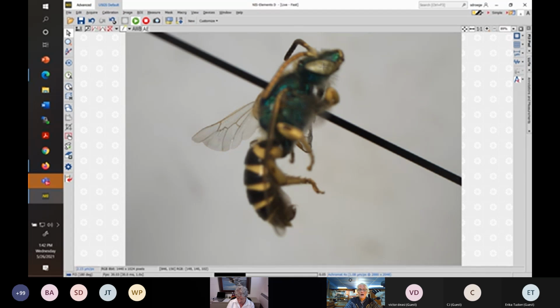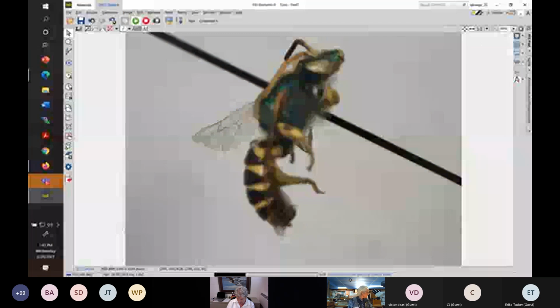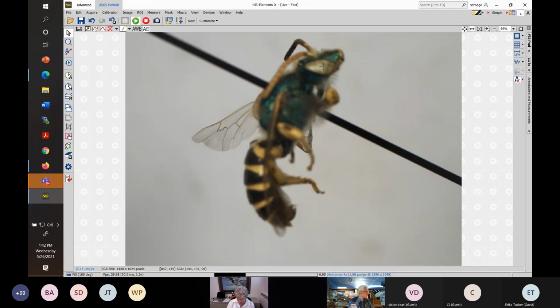I literally will take, let's see, this is what I use here. Can you see this? Can they see that? I'm showing a ruler. Oh, yes, we can see a ruler. So I'm holding a ruler in my hands, and it's clear because that's useful.